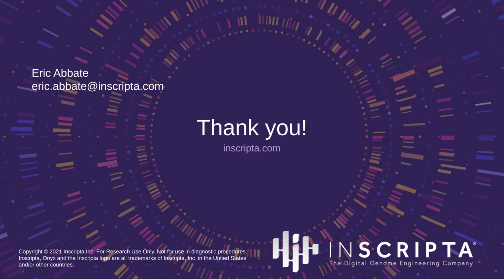You can imagine as you increase the number of locations, 4, 5, 6, 7, and 8, and you're introducing cuts at all of those different sites simultaneously, that can be very toxic to the cells. It's probably going to dramatically decrease your editing efficiency and frequency if you try to introduce cuts at many locations. But a handful of locations, maybe it's going to be okay.